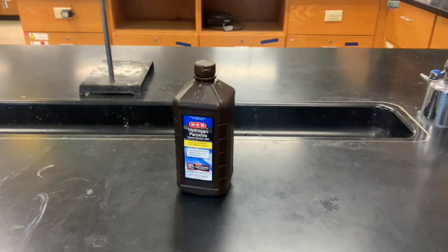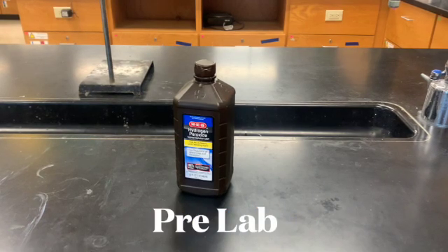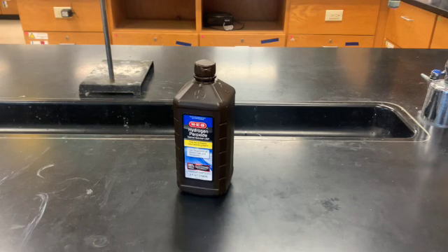Alternative lab. Make sure you do your pre-lab questions because you need those calculations for number 6 for your lab.